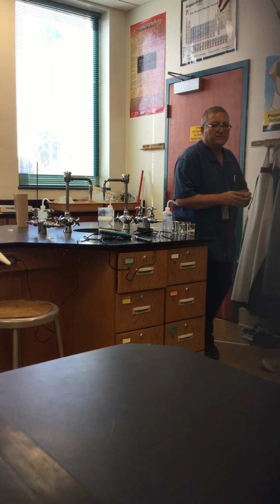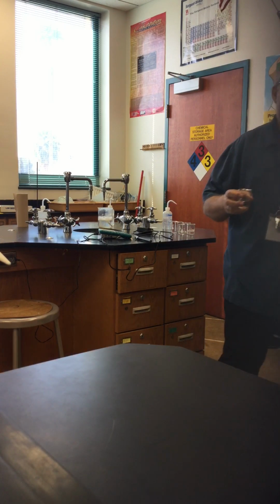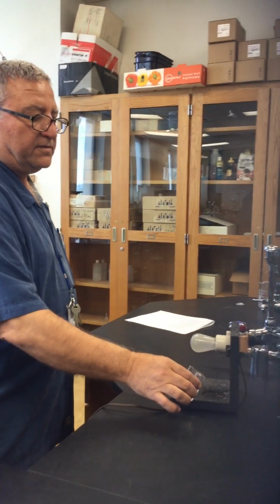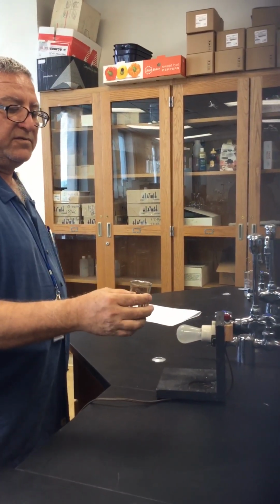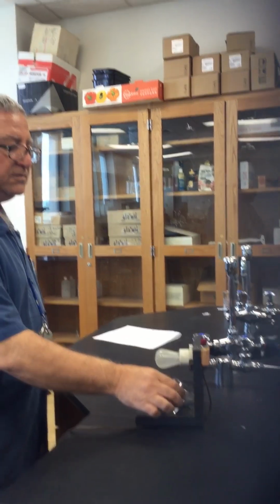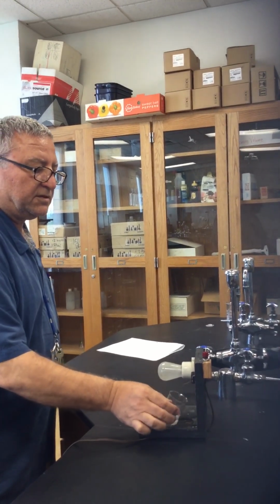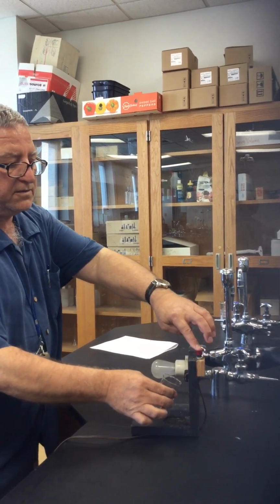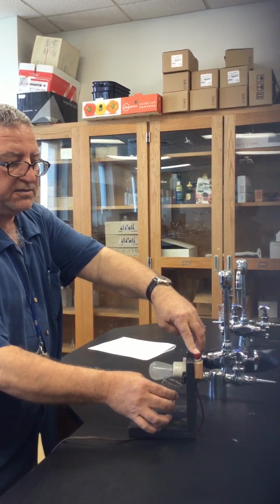And we come here to this machine. If the solution conducts electricity, the light will come on. If it doesn't conduct electricity, then the light does not come on. So make sure the beaker is dry from the outside and your hand is dry. You dip those two electrodes inside the beaker, like that, and we close the circuit. You don't see any lights coming on.